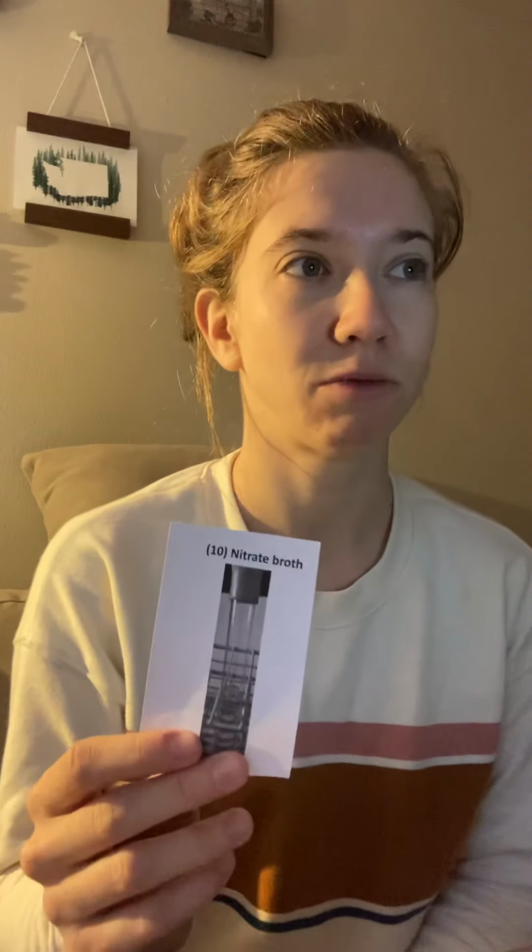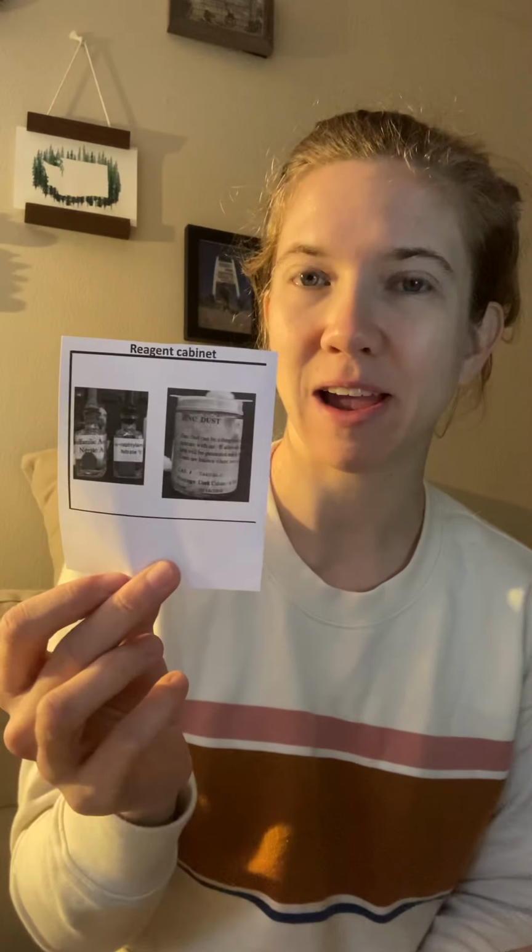At this point, if your broth sample has turned red, we do have a positive reductase result. But we're not going to stop there. There is another step to this experiment to make sure we are actually evaluating if it's a positive or negative reductase result. If the broth is not changing color, then we want to add zinc dust, which is our other thing that we're going to grab from our reagent cabinet.